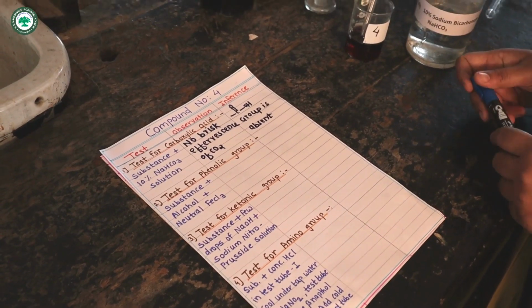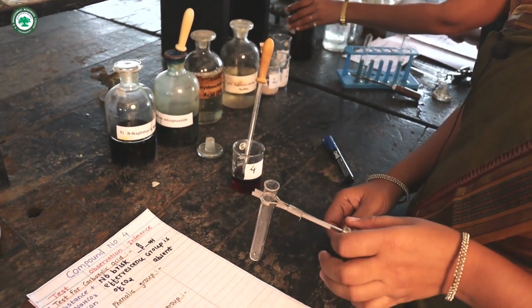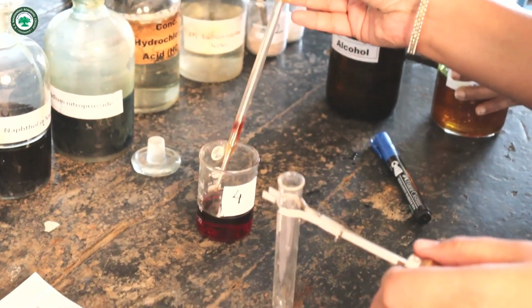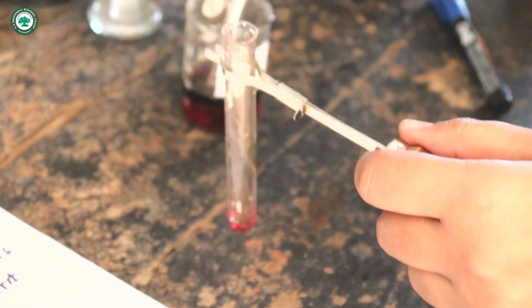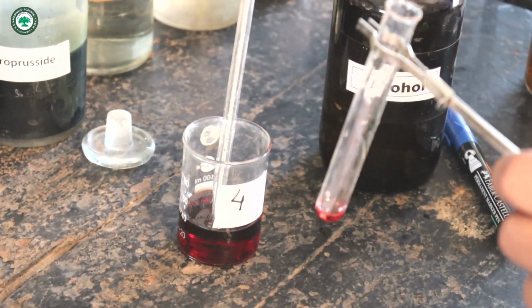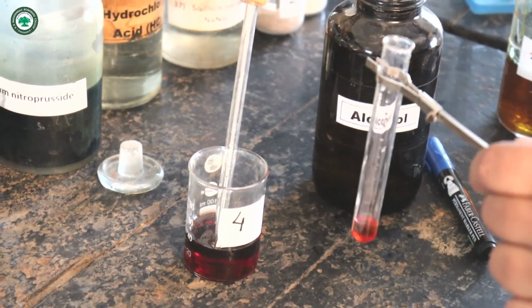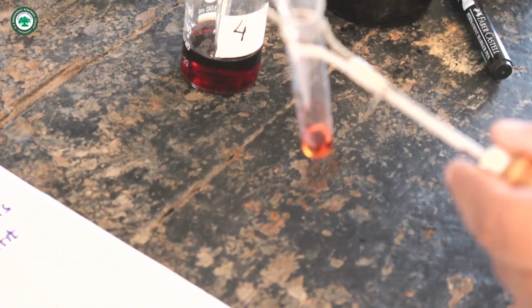Then next test for phenolic group. Take a test tube with test tube holder. Add 1 to 2 drops of compound 4. Add alcohol. Shake the test tube. Then add neutral FeCl3 solution.